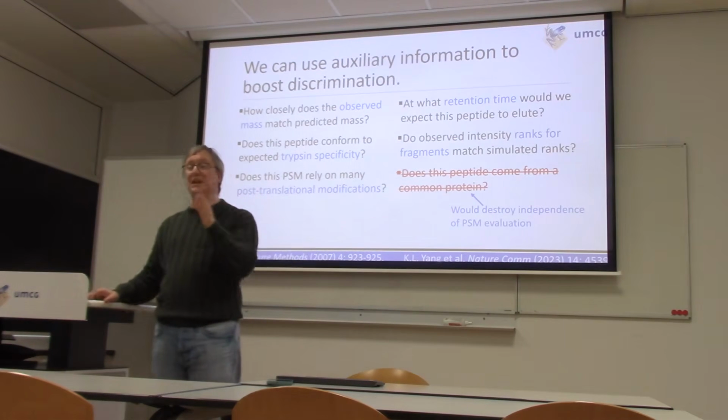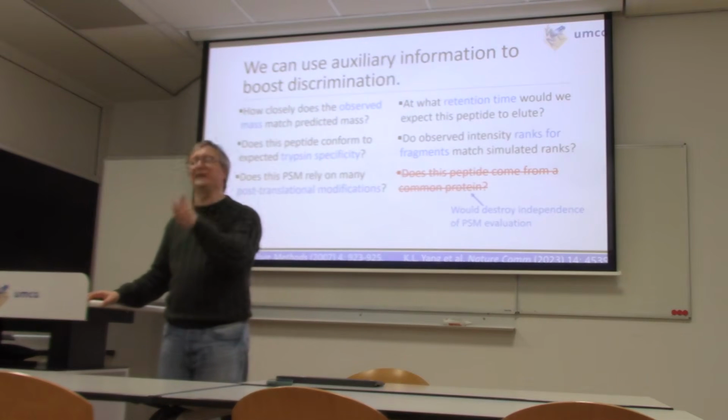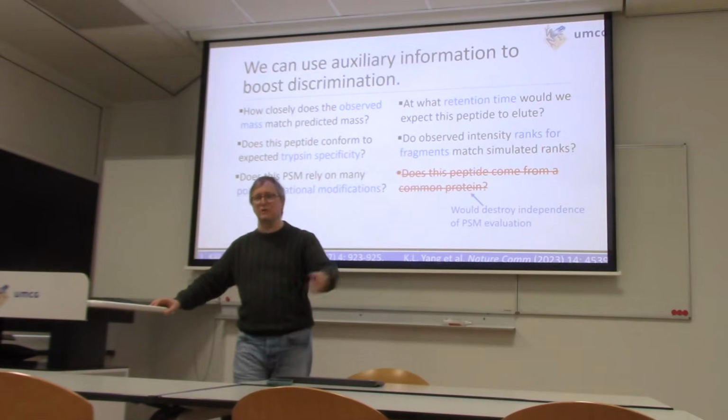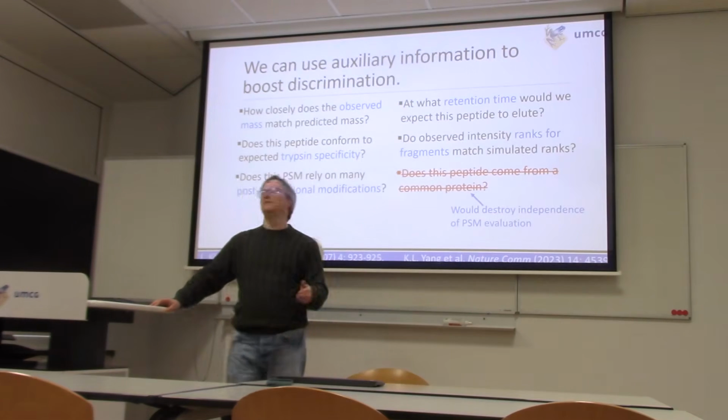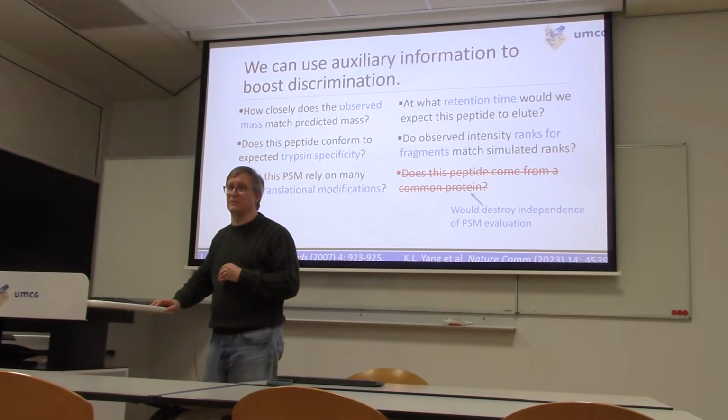So to see a peptide from albumin and say, oh yeah, it's just albumin, that has a really high probability of correctness associated with it. Whereas some random protein that's expressed at a vanishingly low level and only ever gives you 2 peptides if you're looking for it, that protein has a much lower prior probability associated with it.